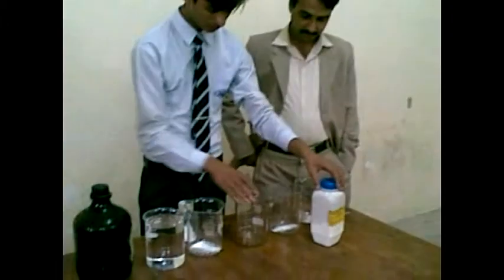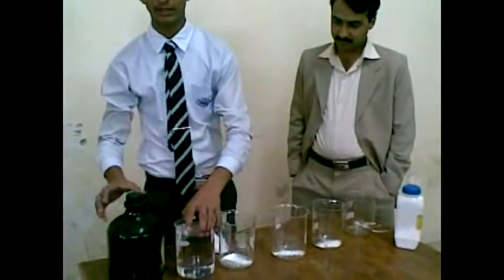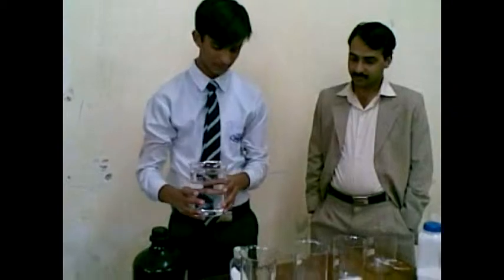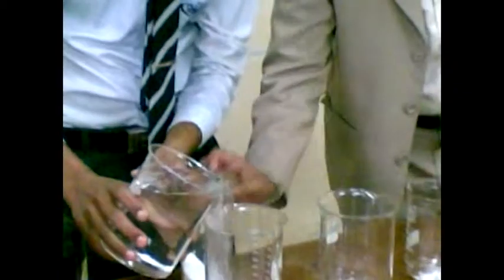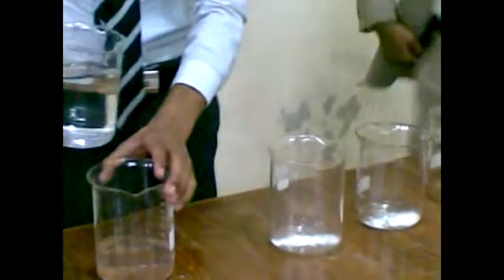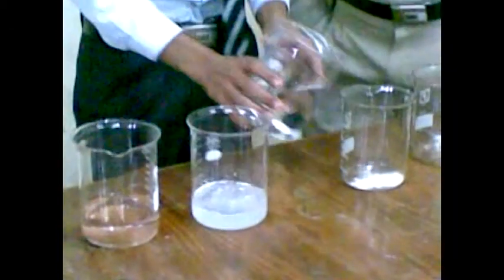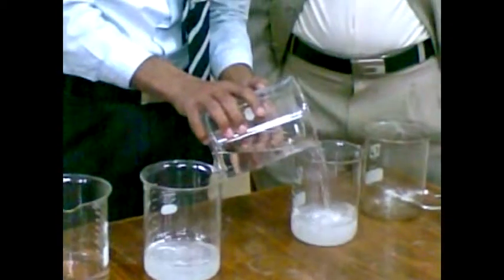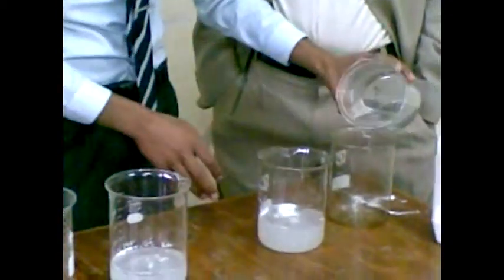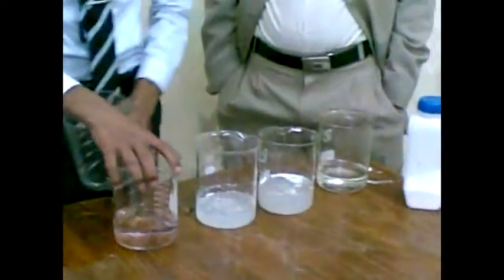Now it is very important. I fill the first beaker with water. Now I am in the second beaker, then in the third beaker. You can observe the water is present in all the beakers.